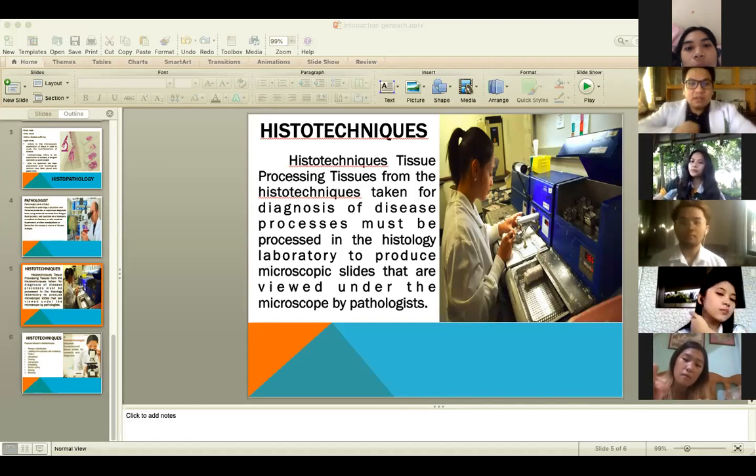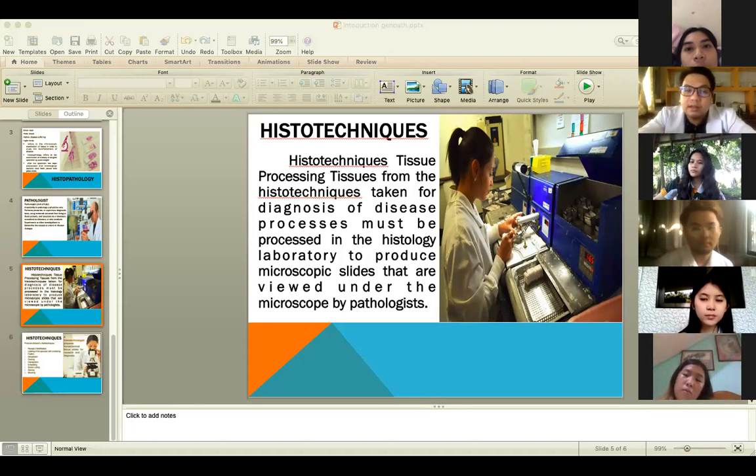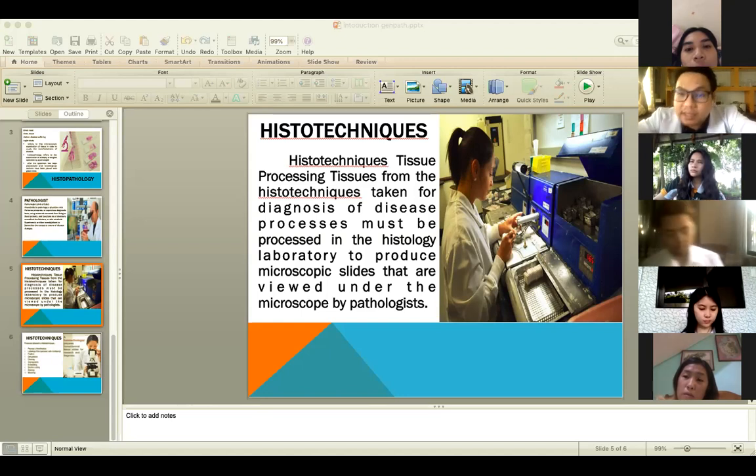Okay, so why do we need, or what's the importance of doing a fresh tissue examination? So, fresh tissue class, we are examining it on a living state, thereby allowing protoplasmic activities such as motion, mitosis, phagocytosis to be observed. Okay, stool exam, di ba? In parasitology, using NSS, that is fresh tissue examination. Okay?